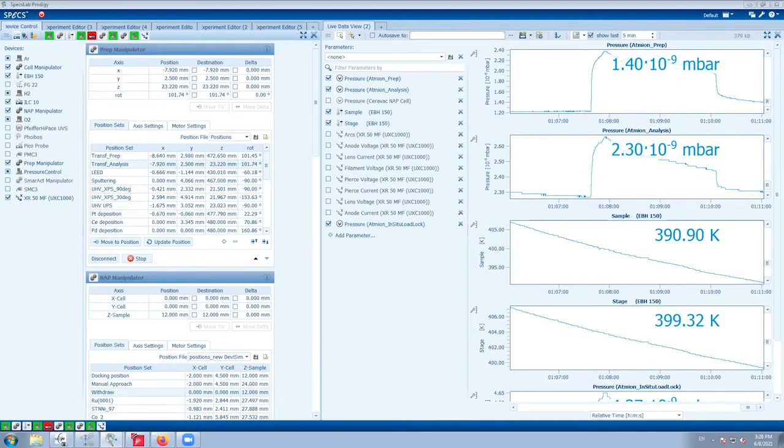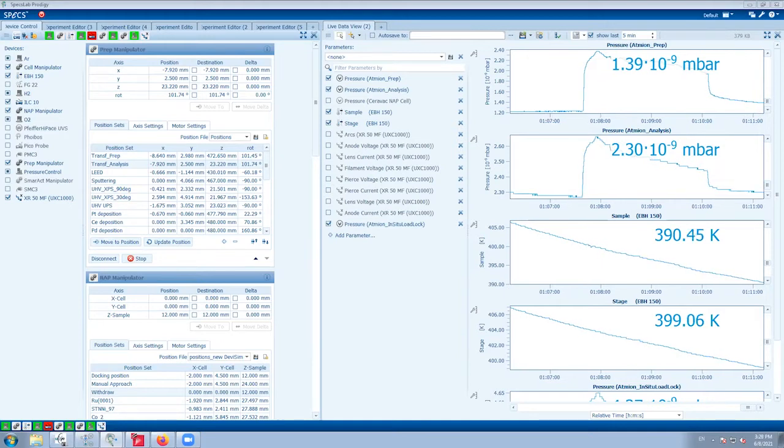We put it inside, and we spot weld the thermocouple on the sample holder as well. So you have good connection, good contact, and it works perfectly. We have good experience with measuring for the sample, and it just doesn't even fall down from it.